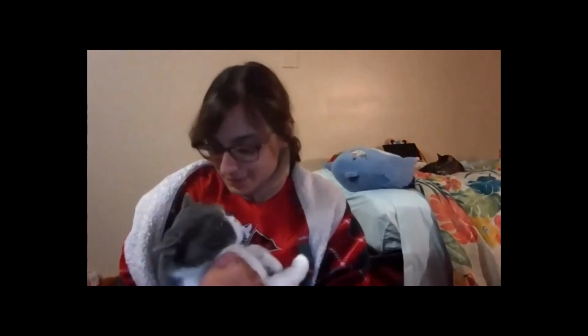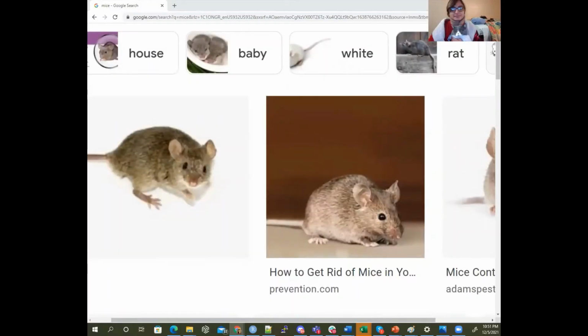Up next, we're going to see how we can map not just to cats, but humans to mice. I'm going to show you some really cool images of mice right now. And let's see if you get activated. You see these images of mice?